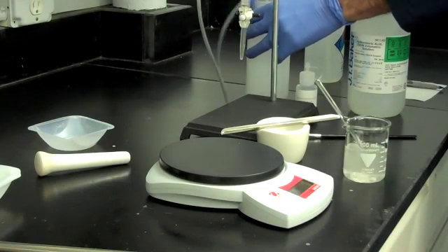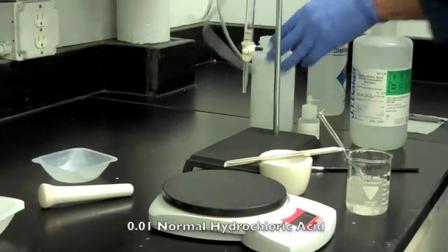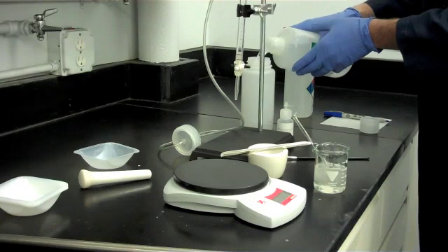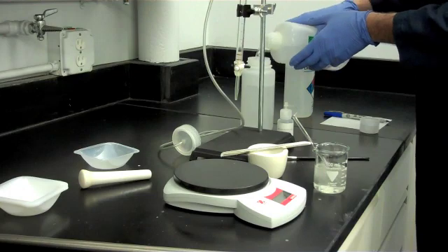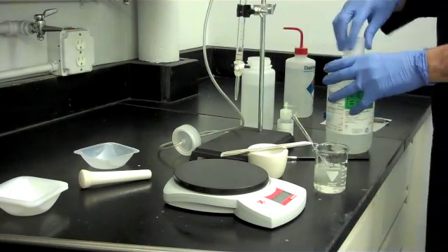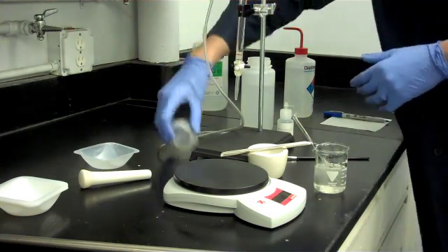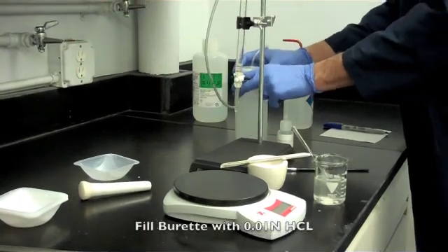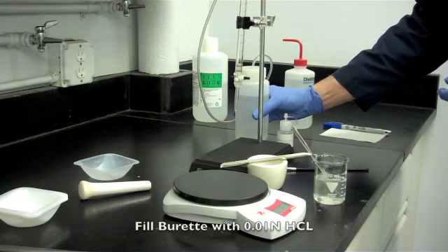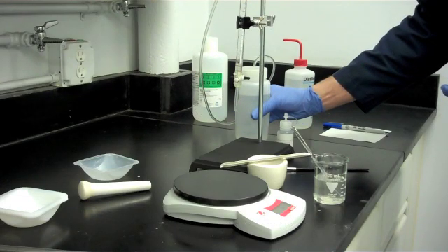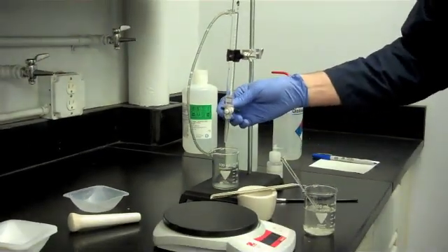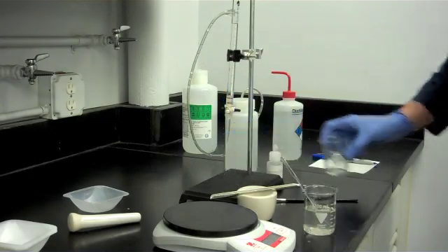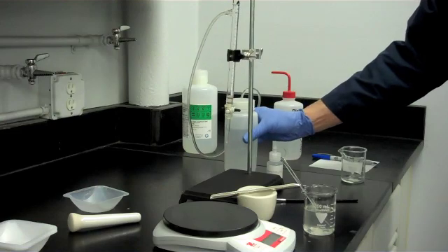Next, fill up the reservoir of the titration kit with the supplied 0.01 normal HCL. Fill the self-serving burette by squeezing the reservoir. Next, clear out any trapped air that may be in the burette. And once again, re-zero the burette with the hydrochloric acid.